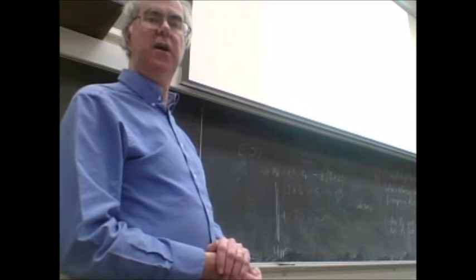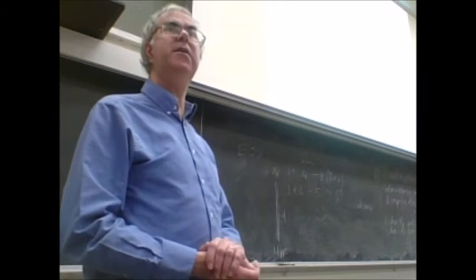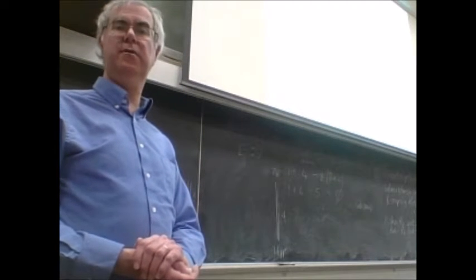Okay, so the next 2 things we have, they're clean peaks. And since we have no symmetry going on, they must be CH2s.